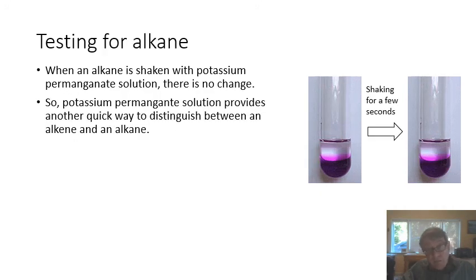Now, if you do the same experiment with an alkane, you get nothing happening. It just stays the same. You shake it, nothing happens.